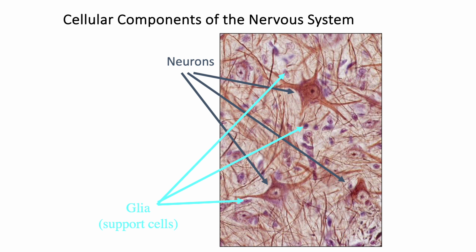So usually it's difficult to tell which one is the axon or dendrite, but when you look at it critically, you will know that the axon has an axon hillock, which is devoid of Nissl granules. So usually that part will be paler, okay, and that will give you an indication of the axon.